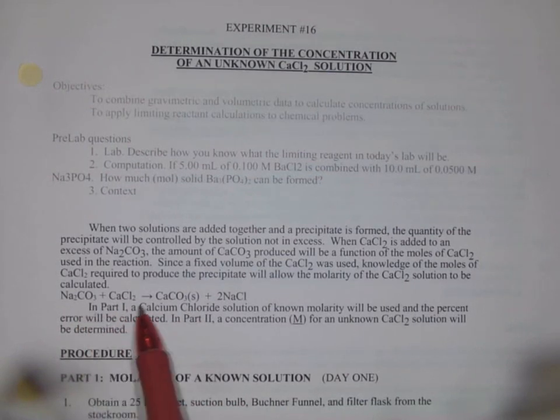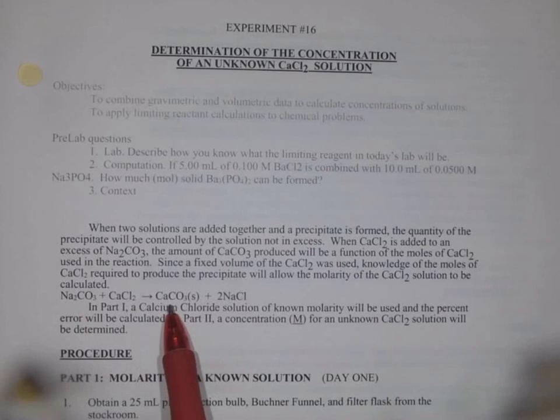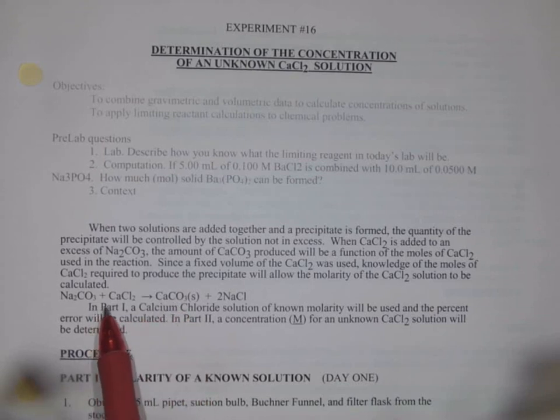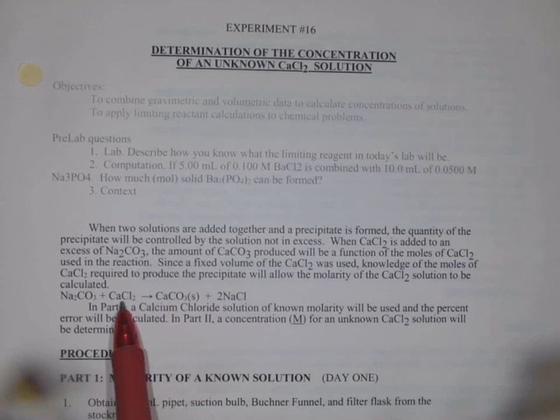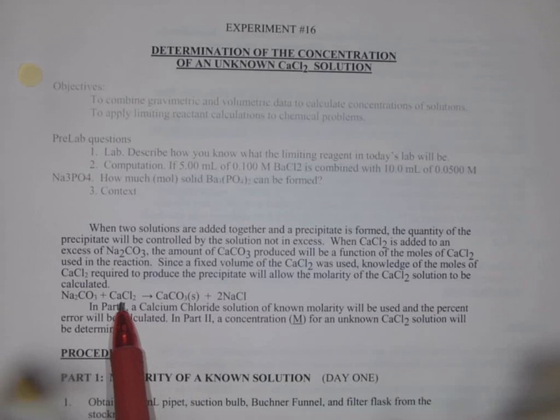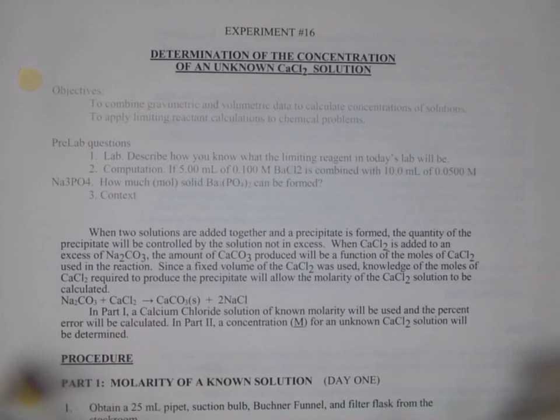These are both soluble salts, but it will form an insoluble calcium carbonate, which we can then weigh and determine how many moles of calcium carbonate there are. Then we work backwards, and based on our knowledge of how many moles of calcium carbonate there is, we know how many moles of calcium chloride was originally used. We also know the volume of that solution, so we can calculate the molarity of that solution.